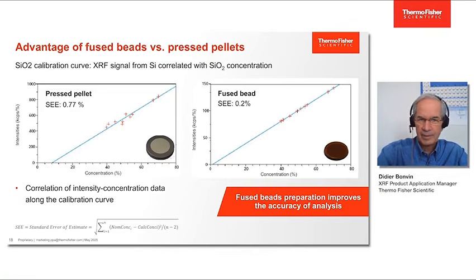As you can see here, in X-ray fluorescence our calibration curve is a straight line. Usually, we would add some matrix corrections in order to improve the accuracy of analysis also. And typically we see on the left the intensities that are obtained from the detector of the spectrometer, and on the x-axis the concentrations.